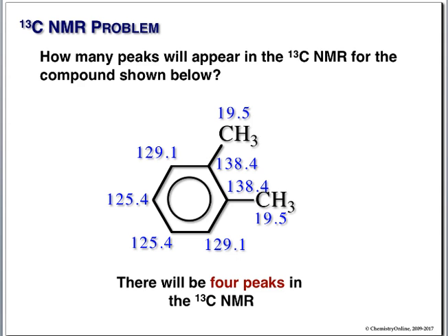All right, let's look at our first complication here. These carbons are attached to hydrogens, aren't they? Now, we said very early on that anything with a spin of 1/2 was going to be NMR active, wasn't it?